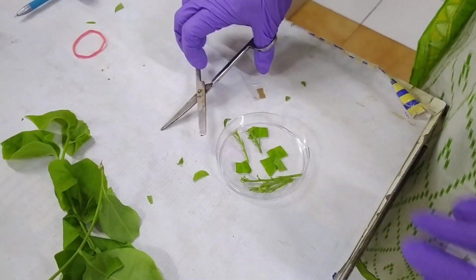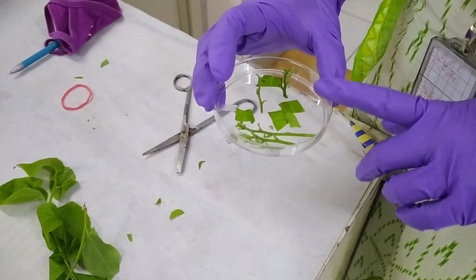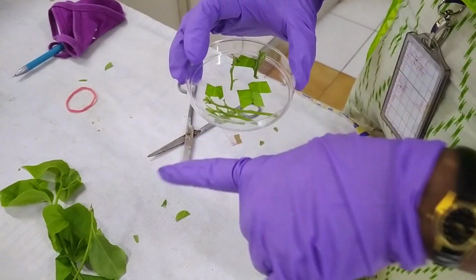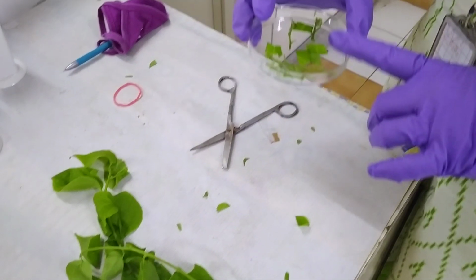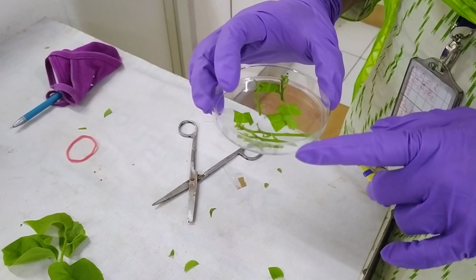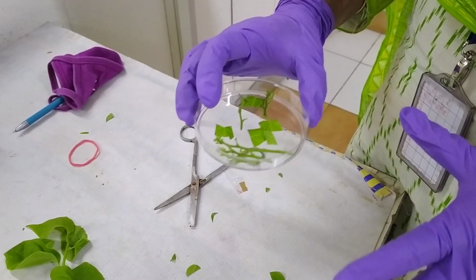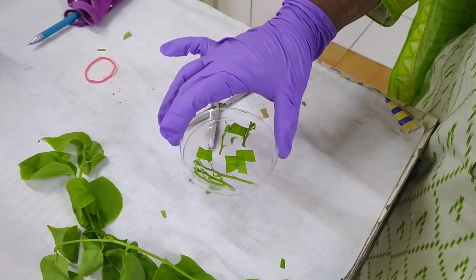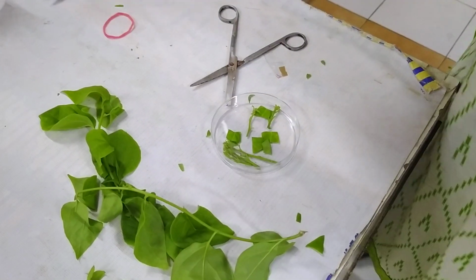Once this is done, since this is from the external environment, it has to be sterile, which we call surface sterilization. Before I cut it, I washed this plant in running tap water. After cutting, this has to be given a wash with Tween 20. Tween is a mild detergent which could be used for tissues. You wash the tissues with Tween, and after the Tween wash, we'll pour water, wash it again, and then take it to the laminar.